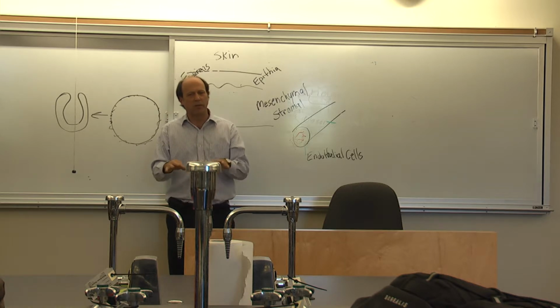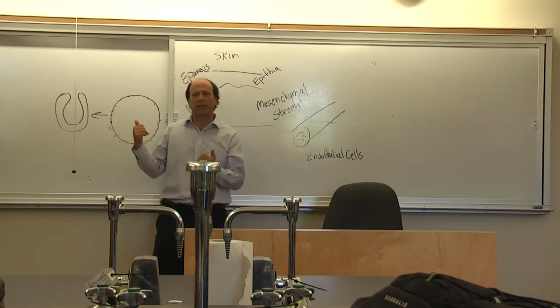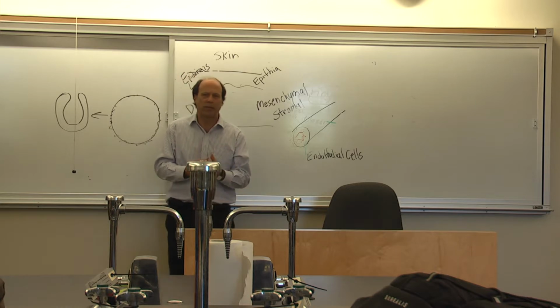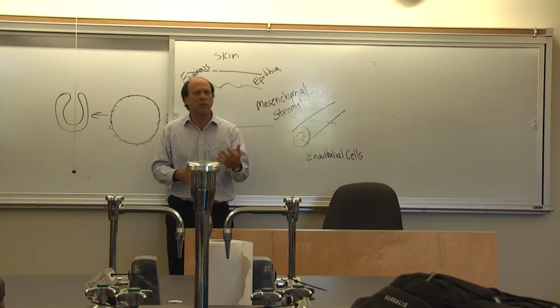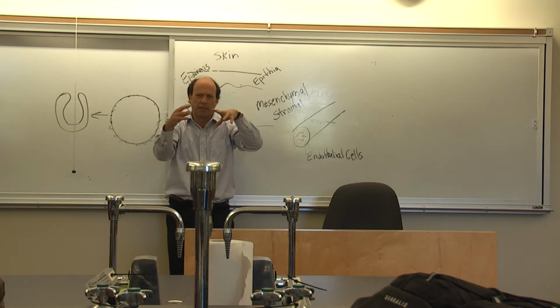Typically, human cells move pretty slowly a lot of the time, so something like time-lapse photography could be really useful. Nonetheless, in this class time, we don't really have enough time to look at some of those interesting things. But we thought we would trypsinize the cells. When you're trypsinizing the cells, they're as flat as a monolayer. And as they're trypsinized, they're going to start to come off, and you're going to see that process of how they start to peel off the plate.